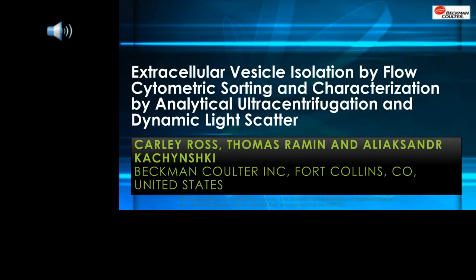Most people are studying particles between 100 and 500 nanometers in size using the flow cytometer. That's pretty typical. 25% of you don't know. 20% are between 500 nanometers to 1 micron, and 11.4% would be greater than 1 micron.